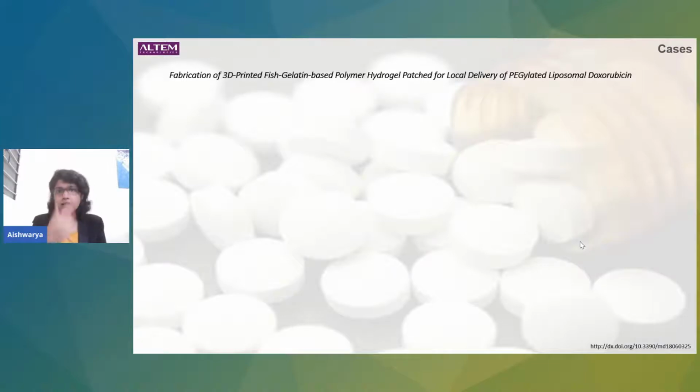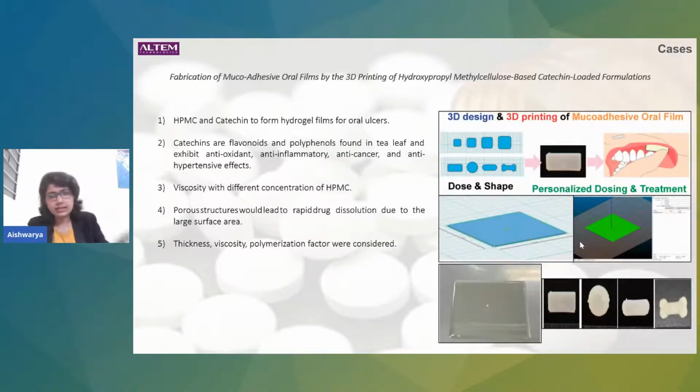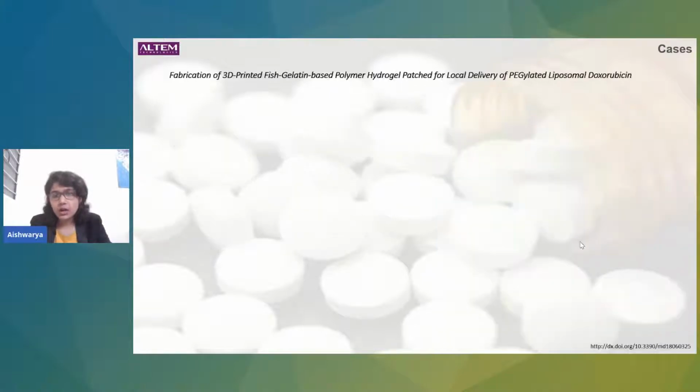So here they're trying to create an even more implantable structure. Whatever structures we have seen previously are all superficial, topical sort of patches that you could use. But this is something which could be more implantable. Implants have to go through a lot of rigorous testing in terms of mechanical properties and degradation factors, because there's a flow of blood through the body and a lot of movement in the body, which can cause quite a lot of degradation.